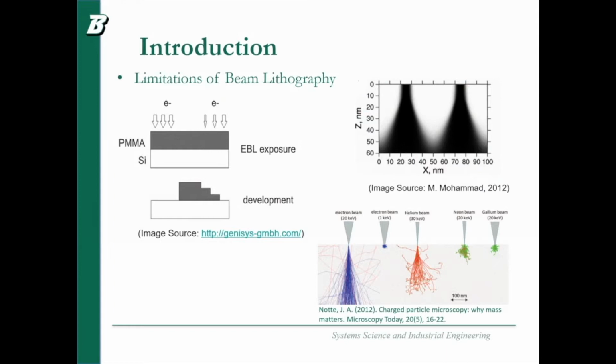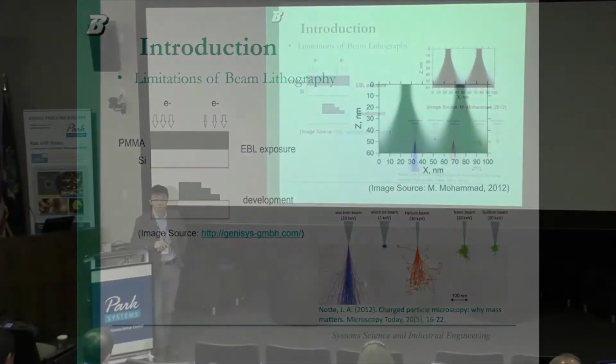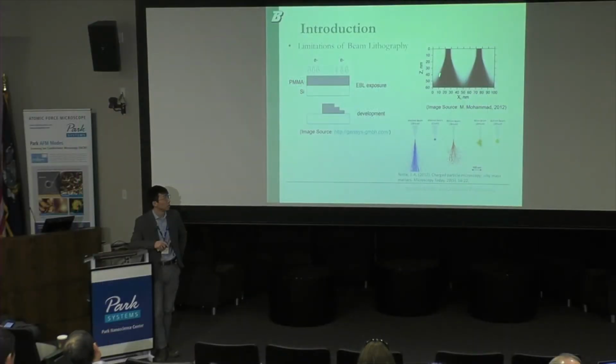So as we just mentioned, electron beam lithography has its own limitations because of forward scattering and backward scattering. Forward scattering is because the electrons are really light. When they bump into the materials, they tend to diffract randomly. So the features actually become larger. That means you cannot go that deep, because the feature is going to be out of its original dimension and become considerably large. Also, for backward scattering, the substrate can scatter electrons backwards and affect the manufacturing resolution.